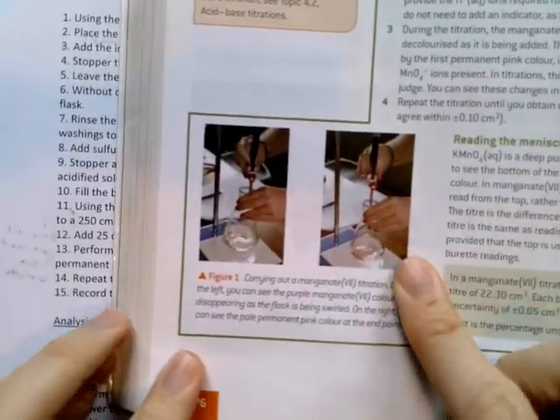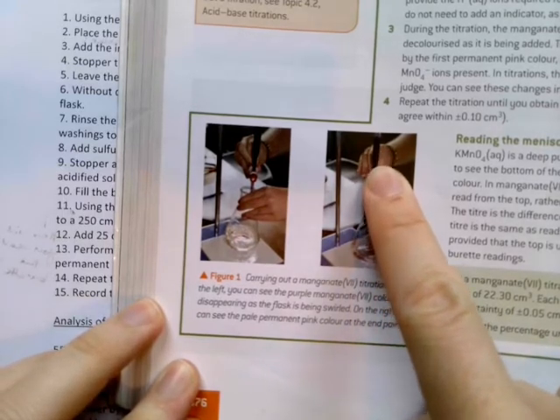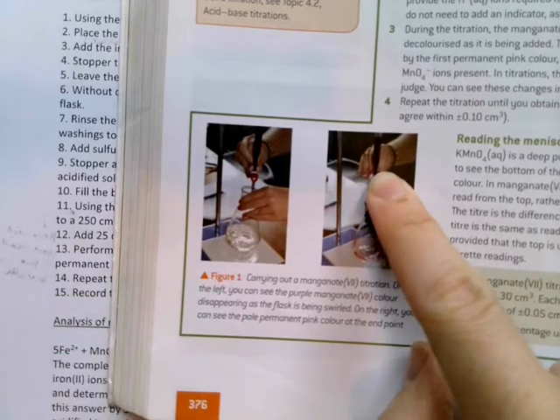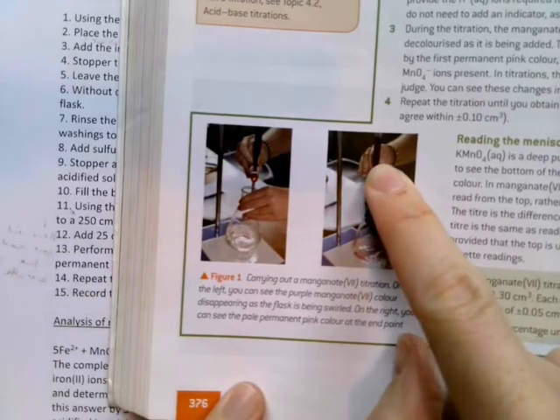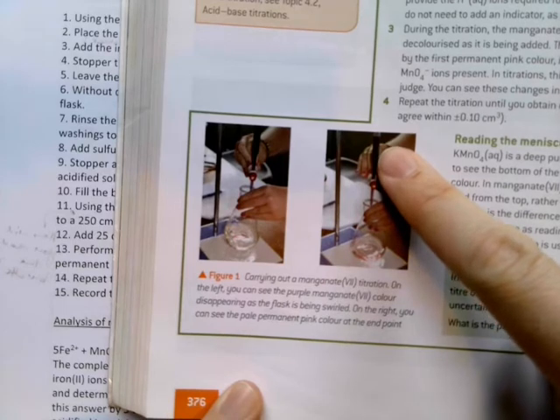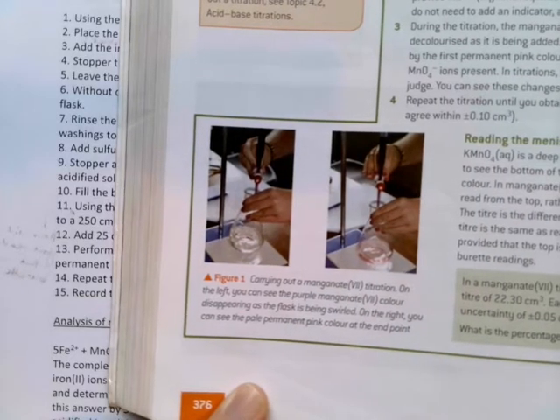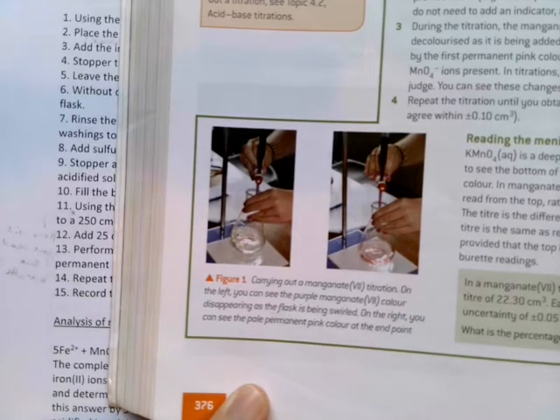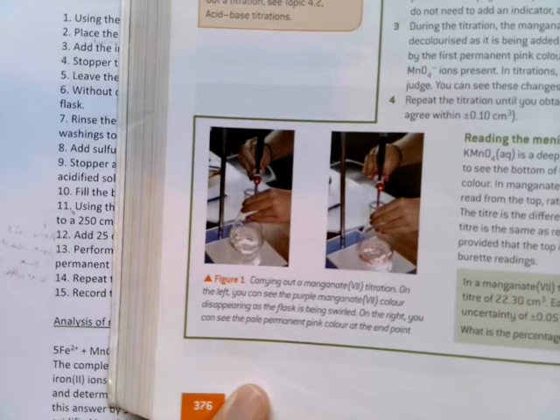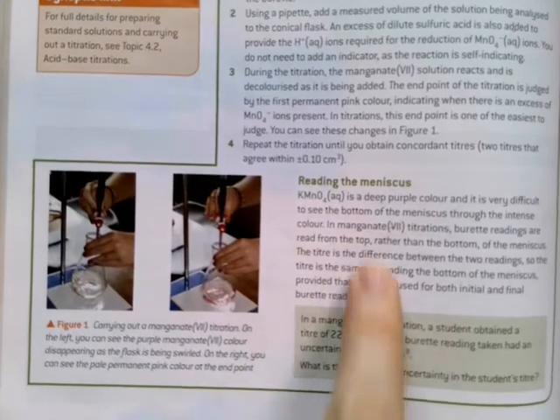And you'll see in this picture here, it might not be very clear, but if you go on the website and look at it, the potassium manganate in the burette is this deep, deep purple colour. It's not like our normal acid-base titrations where you've got a clear solution in here. This is this dark purple, which means that you cannot see where the meniscus is, because the solution is not see-through, which means that when you measure the volume in the burette, you can't use the meniscus. So unlike a normal acid-base titration, when you do this one with potassium manganate, you need to read the level of the burette from the top. So it actually has this little bit here that you can read about it.